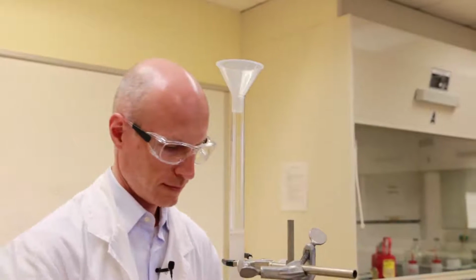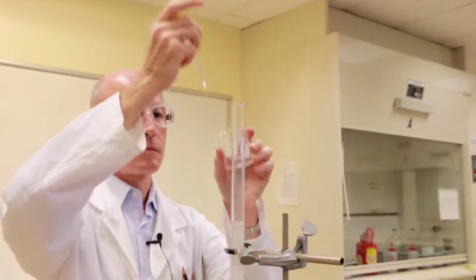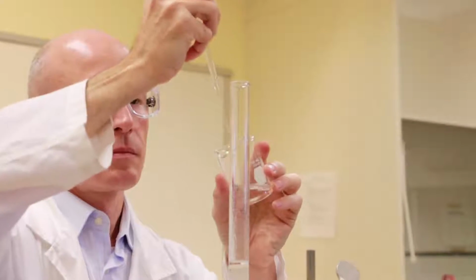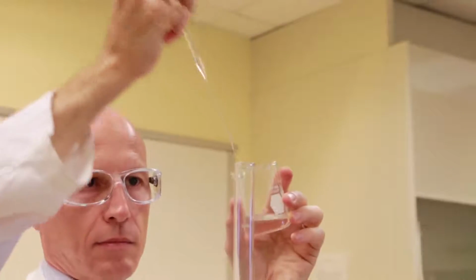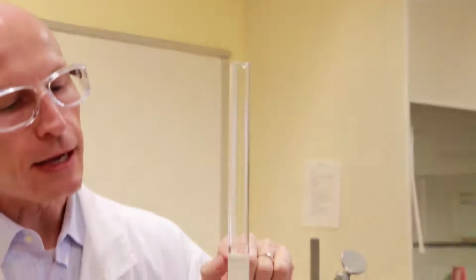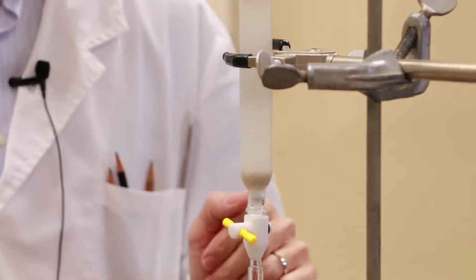Like that. And then with a pipette, you may want to rinse the sides of the column. And let the solvent drain until the sand goes dry. And you want to stop right there. So the sand is dry, but the silica gel is not. At this point, your column is packed and is ready to be loaded.